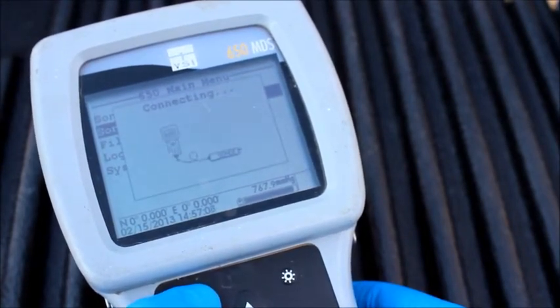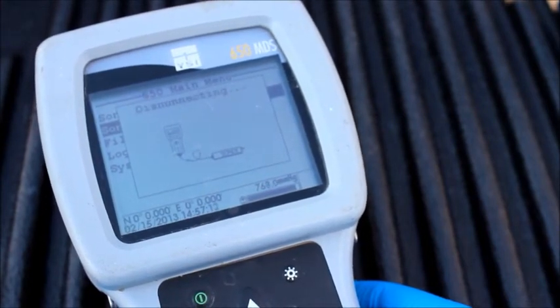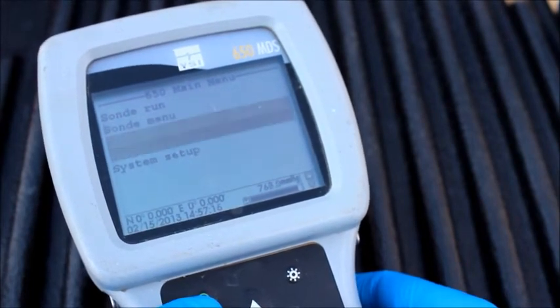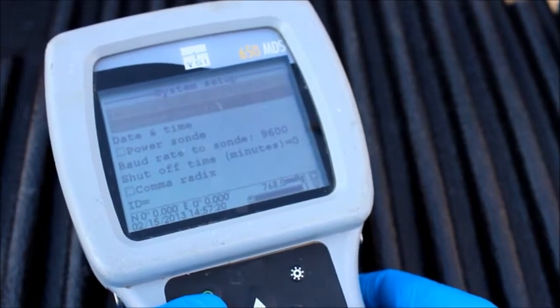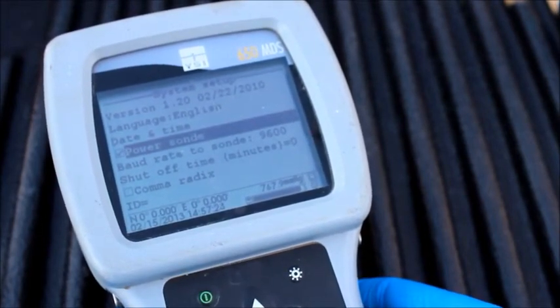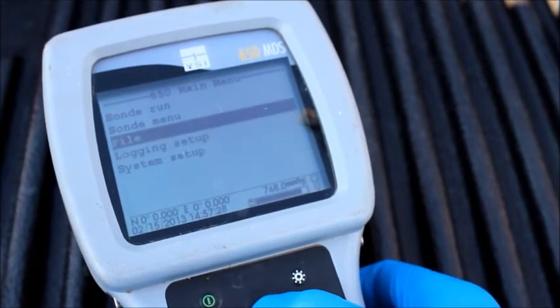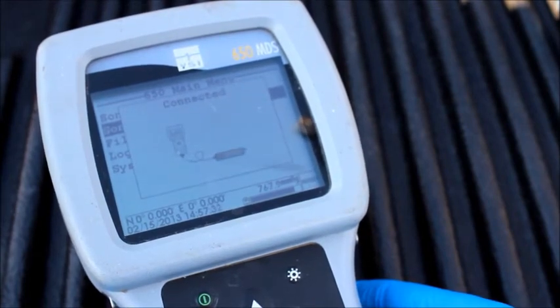Once the new batteries are installed, you may notice that the 650 display no longer connects to the sonde. Press the escape button, scroll down, and select the system setup screen. If the power sonde option is not checked, scroll to it and press the enter button. The handheld display should now be able to send power to the sonde and connect.